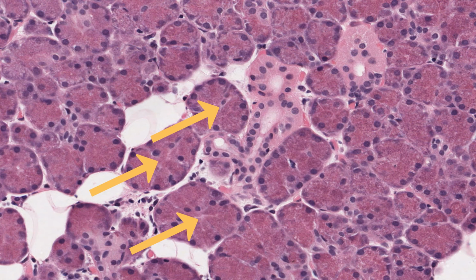And finally, a cell type of the intralobular stroma worth mentioning is the plasma cell. It secretes antibodies, mostly immunoglobulin A, as an important component of saliva. They're probably these cells here with a dark nucleus and eosinophilic cytoplasm, with a hint of a clear region which would be the extensive Golgi apparatus. But very hard to really be confident recognizing these cells.